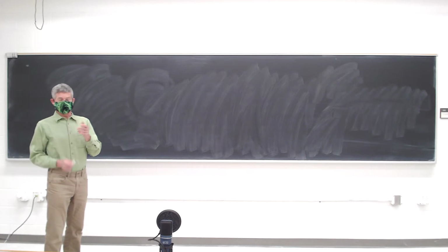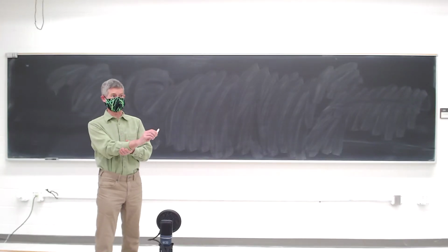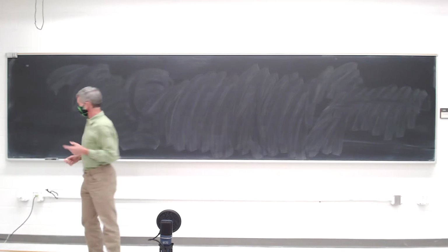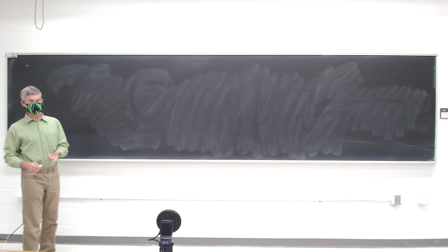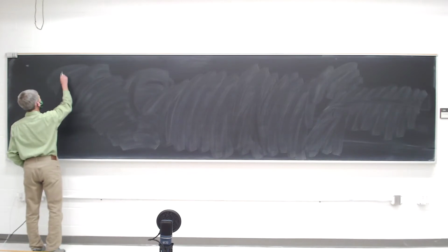But before that, we're going to do the second to last of the types of spectroscopy. We talked about IR and NMR spectroscopy last semester. This semester we're going to talk about mass spectrometry, and we're going to talk about UV visible spectroscopy.